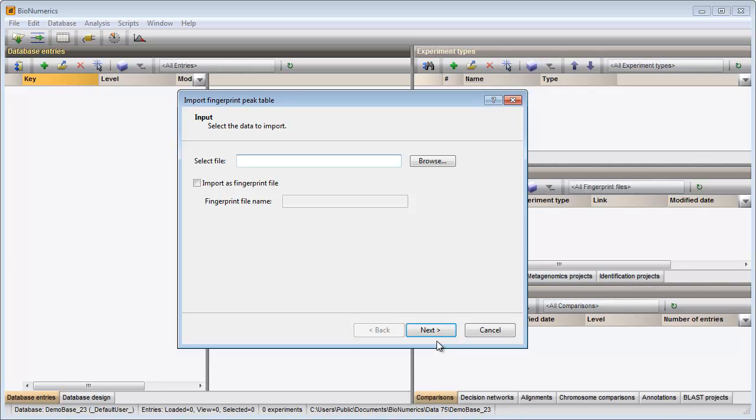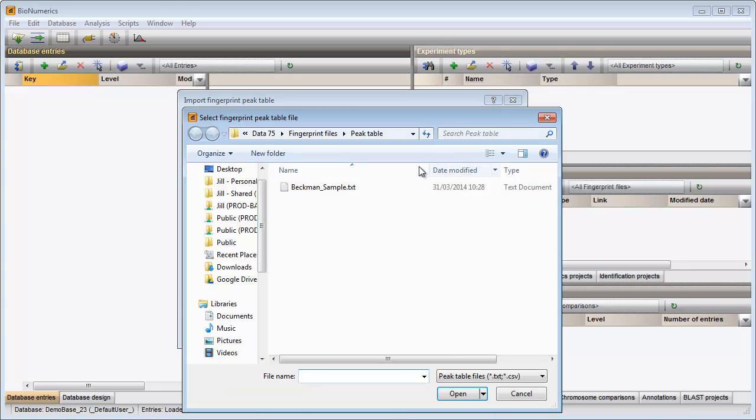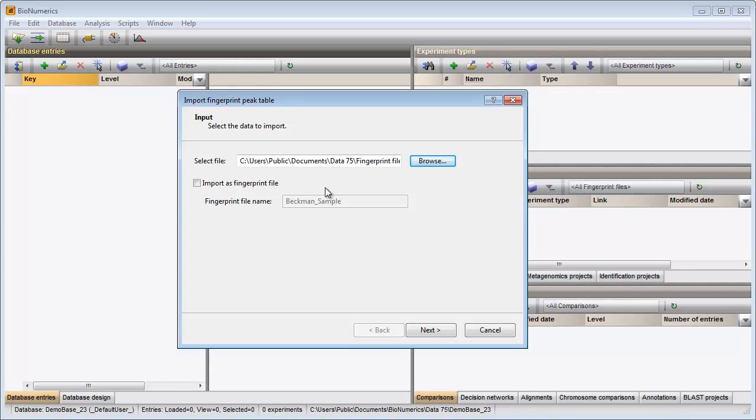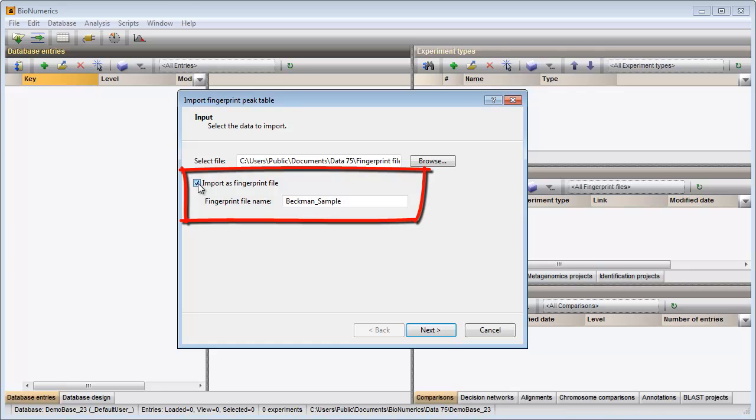In the first step, I need to browse for the peak file. When checking the option import as fingerprint file, curve files will be created using the height, size and area information that is present in the selected peak file.